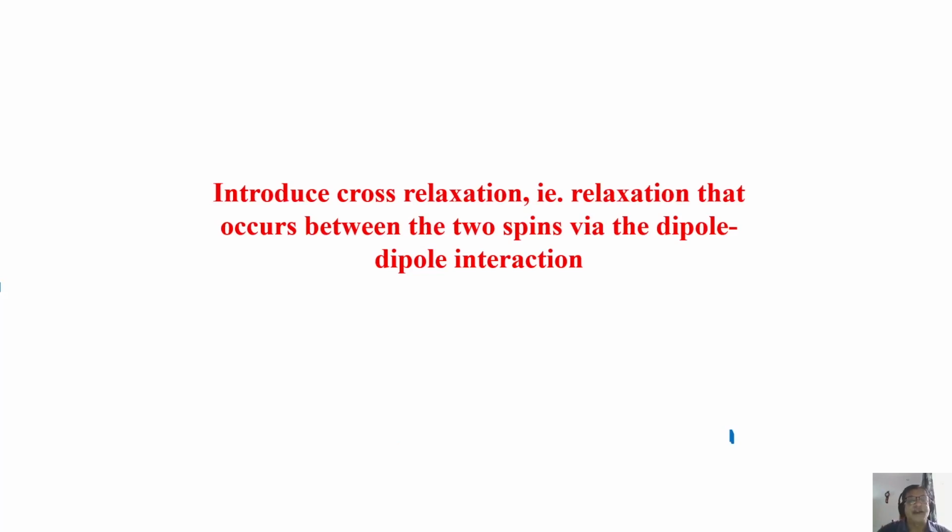And then I wanted to take two spins which are uncoupled and close in space with a dipolar interaction. We worked out from the energy level diagram. I briefed you what is W1, W2, W0, which are transition probabilities for the spins. So we wanted to understand, because of irradiation by the second radio frequency, I said NOE occurs and then there will be change in the intensity of the observed peak. After irradiating somewhere we will see the change in the intensity of the peak.